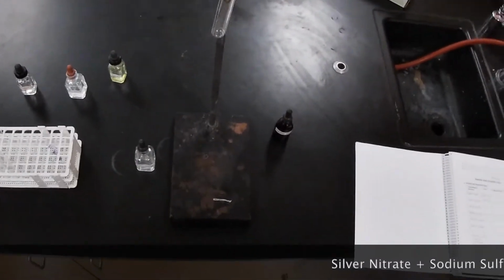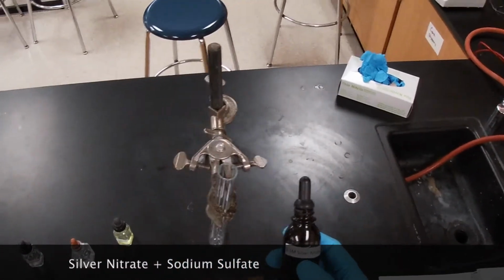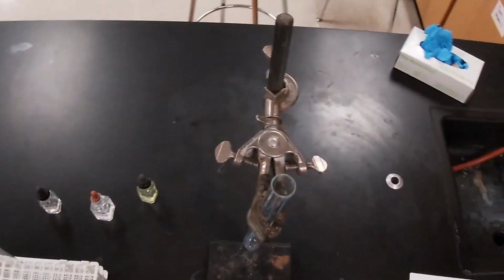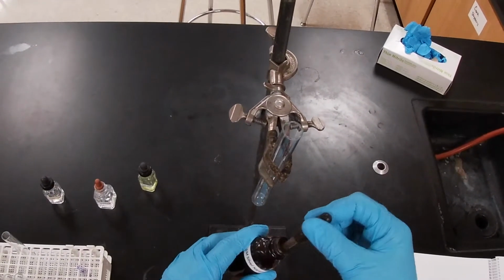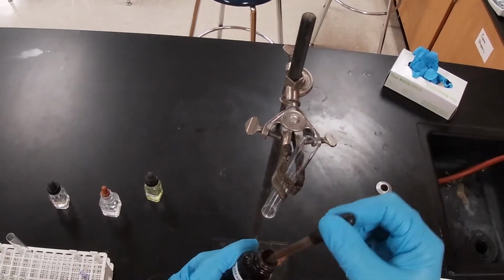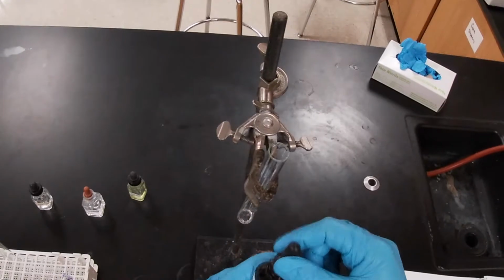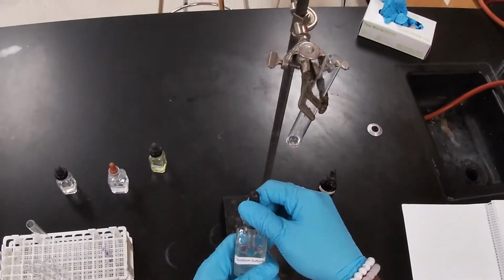We're going to go ahead and do our second reaction. This reaction is going to be silver nitrate, 0.1 molar solution, and some sodium sulfate. It doesn't matter which one you start off with. We'll go ahead and get the silver nitrate solution here, add a little bit more to get a better effect, and then I'm going to add a few droplets of sodium sulfate.